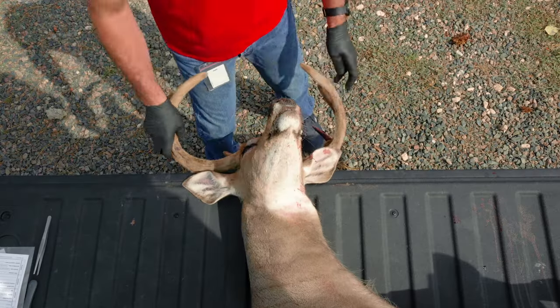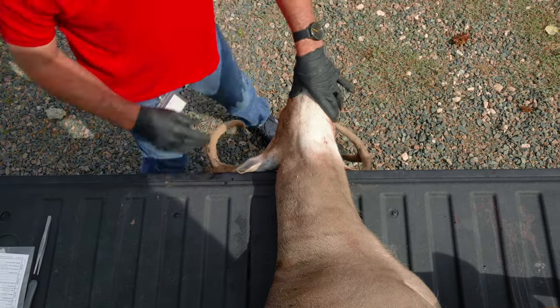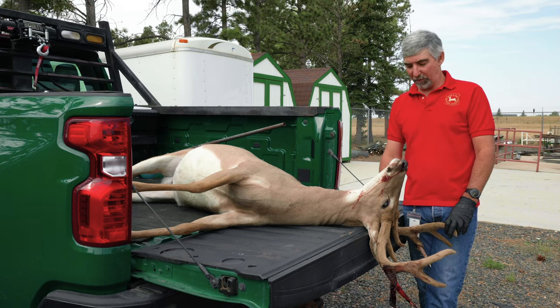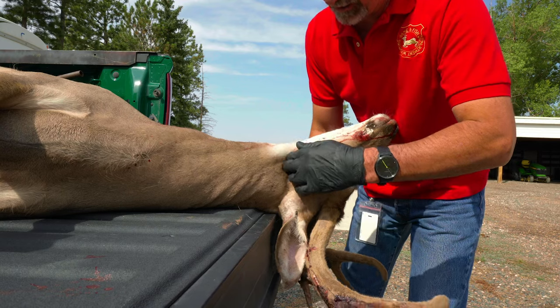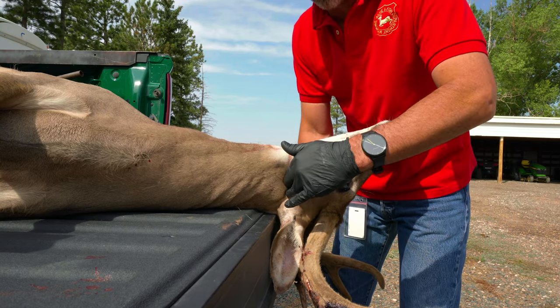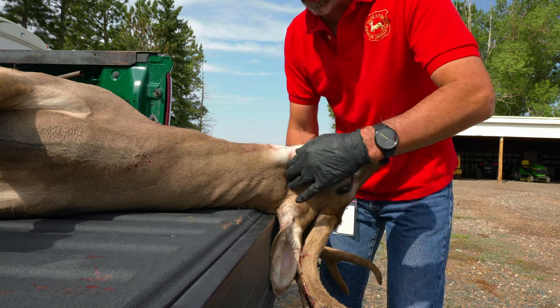First of all, you want to get the animal pulled towards the end of the tailgate. It's really nice to do it on a tailgate where you can drop that head down just on the edge — that really helps. But if you happen to be flat on the ground, that's fine as well. Before you start cutting, it's important that you figure out your landmarks and where you need to begin your cut. I do that by finding the back of the jawbone, right there.